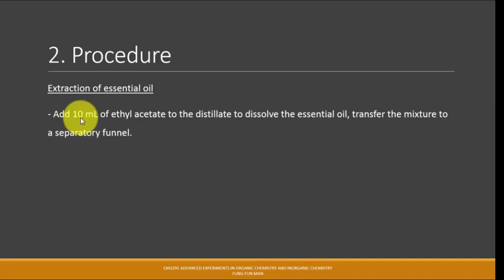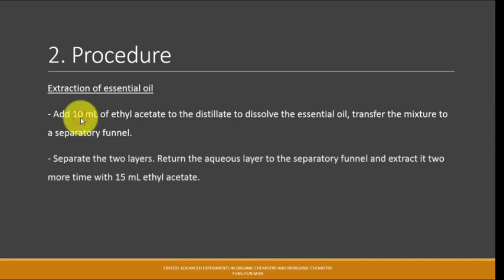It is for the collection, to draw the oil from the suspension of clove oil and water to the organic phase. So the more you have, it can be a disadvantage or could be some merit. It depends. Later on, you may need to do 2 or 3 times rotovap to evaporate all the organic solvent, but it doesn't really significantly change your compound integrity and whatsoever. So please fret not.